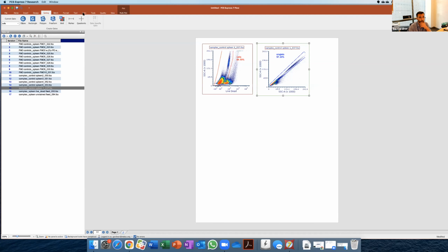In fact, if you go to gating, you see here the data specific gate, right? As we select the gate, I could click here, data specific gate. So let me just show you, if I refresh the data, the gates are all the same, right? They're being applied equally.